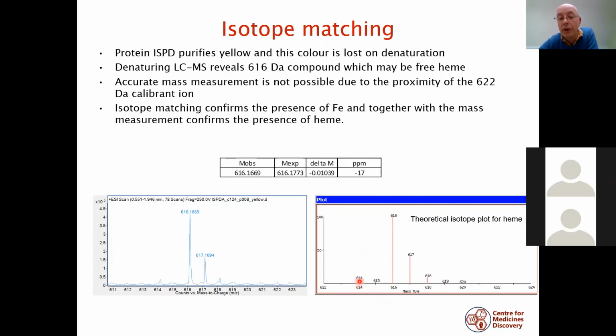As you can see, you've got these peaks here, which you would not expect with a normal carbon-containing compound without iron. And this is the isotope envelope that we measured. All these peaks are represented. This one is here, this one is here, and these correspond exactly to the theoretical isotope distribution. So you don't get much chance to use this, but when you do, it works extremely well.